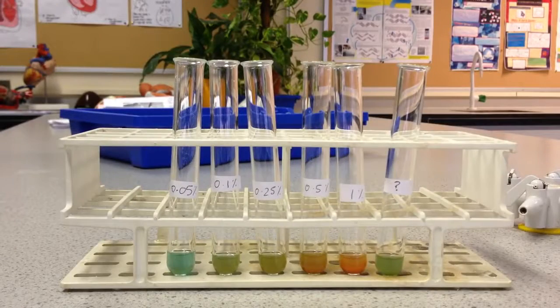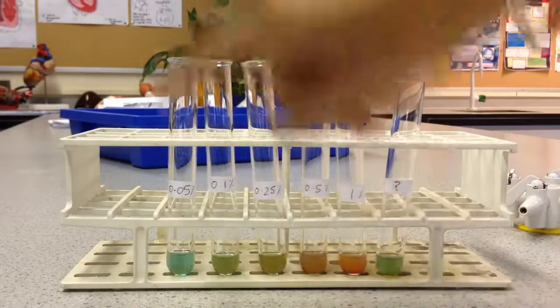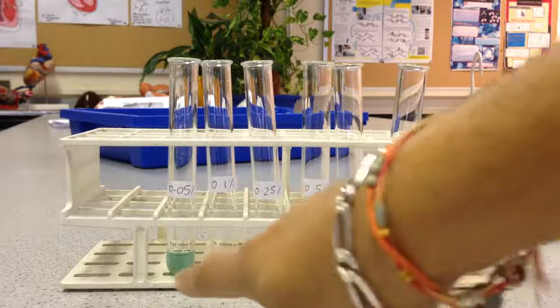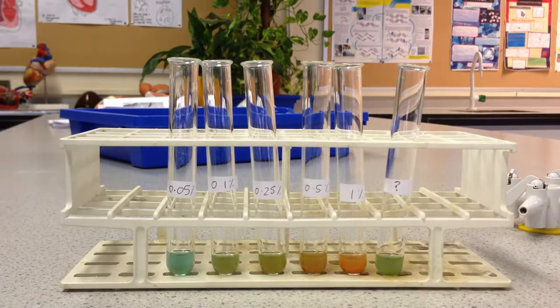Okay, so what we are going to do is then to measure the amount of copper ions left in solution. Essentially, that depends on absorbance or transmission of light of particular wavelengths. Now, what you can't do with these solutions is to measure absorbance or transmission, because they are all different colors. And for colorimetry, you need to be measuring the transmission or absorbance of a particular color, i.e. a particular wavelength of light.